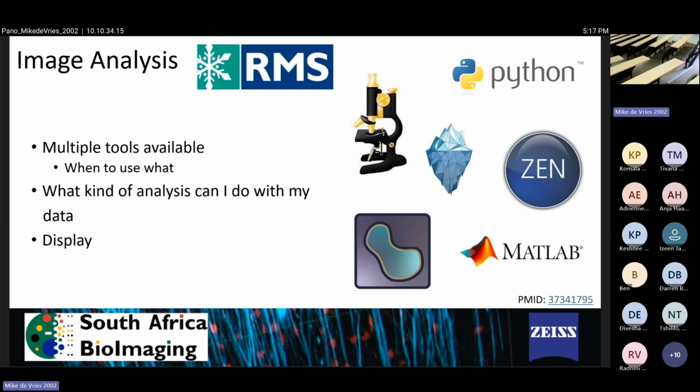do they actually know also what it means? And like Lisa said, we talked about the data storage, about the NAS and everything. Even Stellenbosch University has now become aware of the big data problem and data being lost when students leave. So they have started implementing each department having a storage unit for the data, not only microscopy, but any data that is produced, so that if someone leaves, you know where it is.